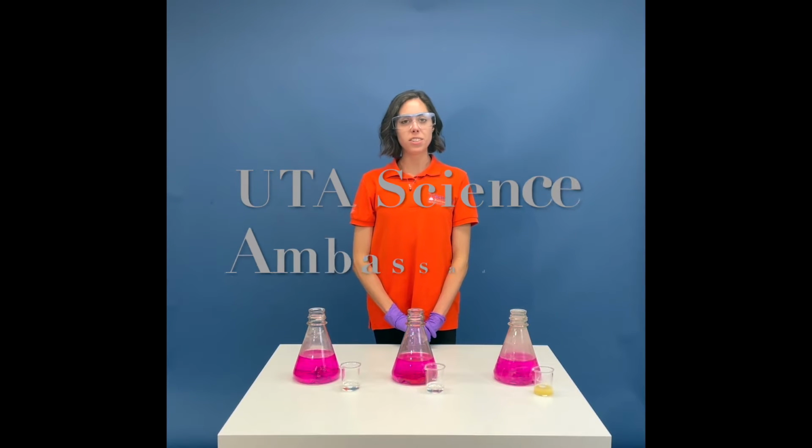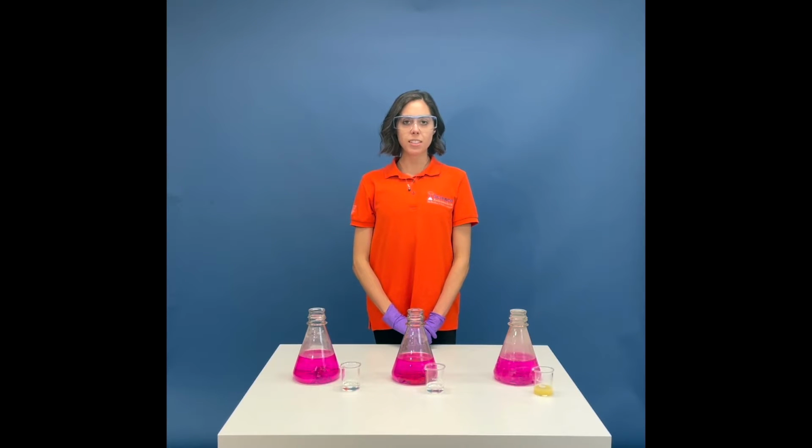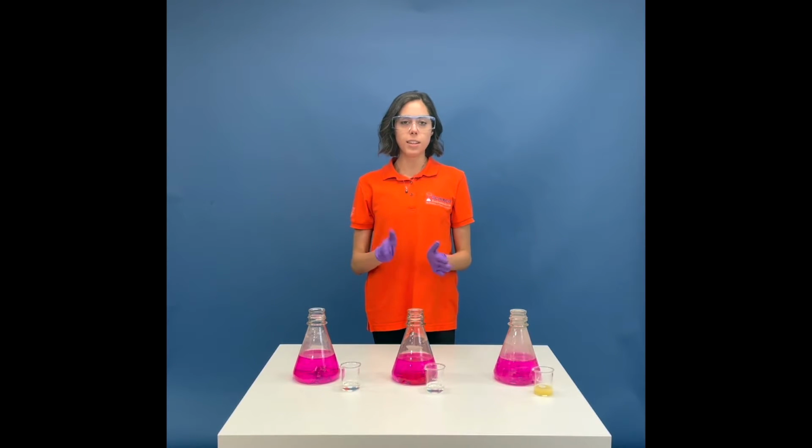I am a science ambassador here at the University of Texas at Arlington. Today, I'm going to show you guys a demonstration on acids and bases. Acids and bases are solutions that range on a pH scale. A pH scale ranges from 0 to 14, with 7 being neutral. 0 to 7 is going to be a solution that's more acidic, whereas 7 to 14 is going to be a solution that's more basic.